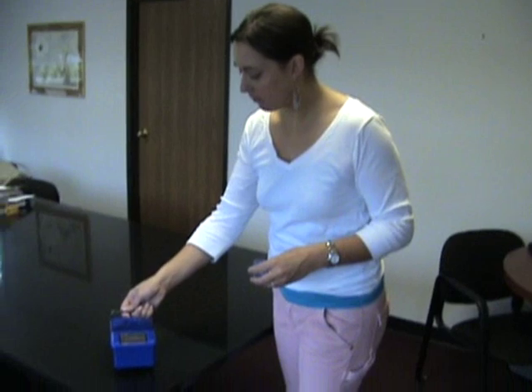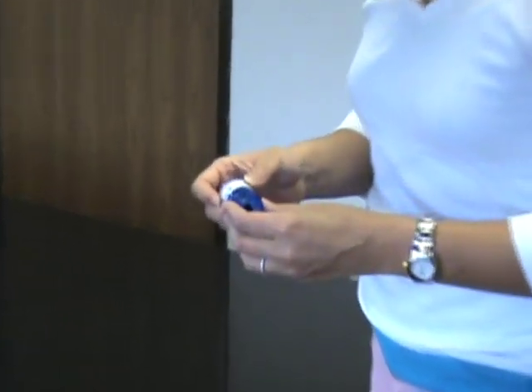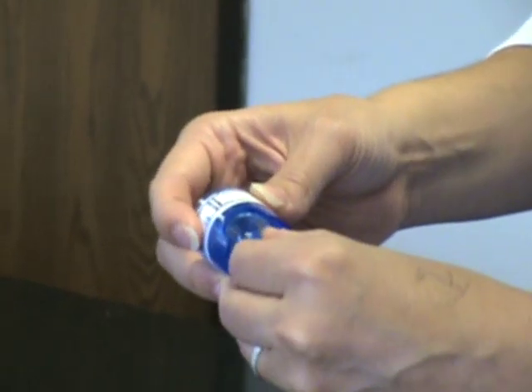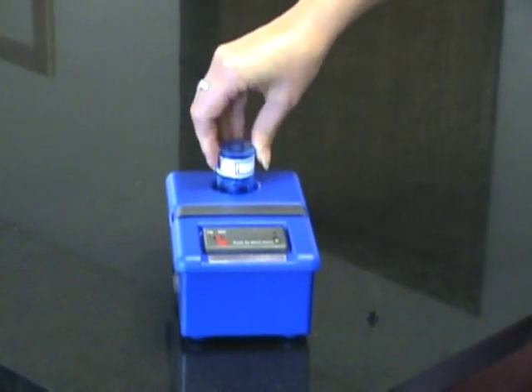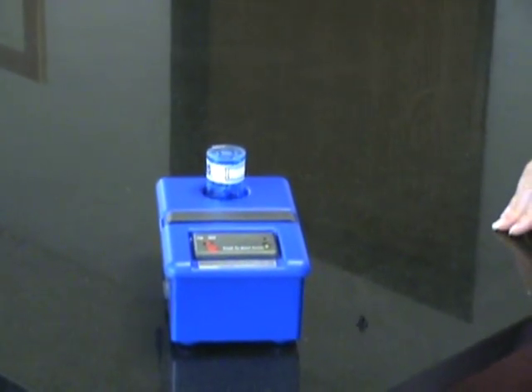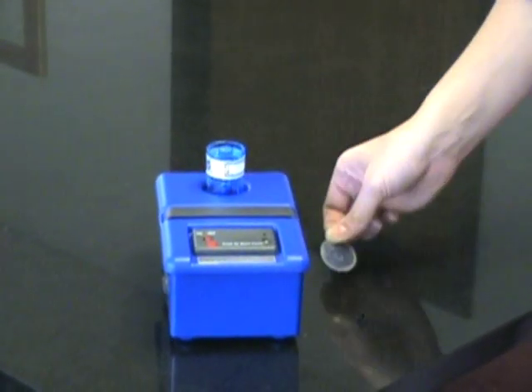To perform the Examine Air test, place the Examine Air pump on a table or chair in the room you wish to test. Next, remove the black pin from the bottom of the air sampling cassette and insert it on the pump by gently pushing the cassette onto the circular opening of the pump. Now remove the sticker from the top of the air sampling cassette.